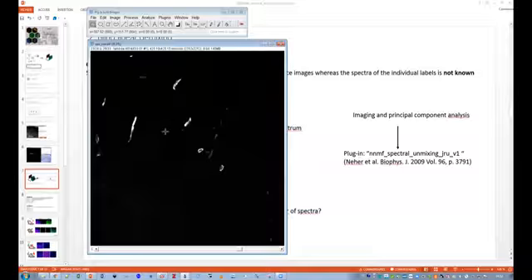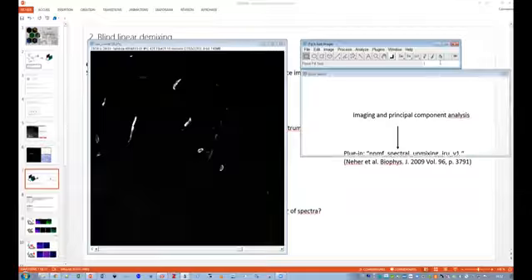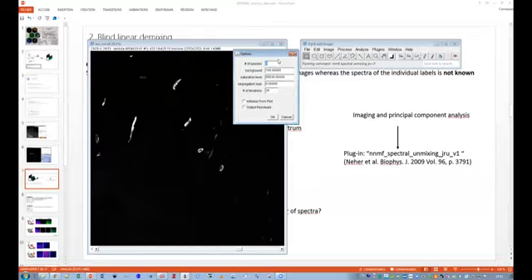And then it allows you to have the eigenvectors and the spatial distribution of your fluorescence signal, so to have the eigen images. And to do that, you have to go to Fiji, NMF, again from the Stowers plugin.